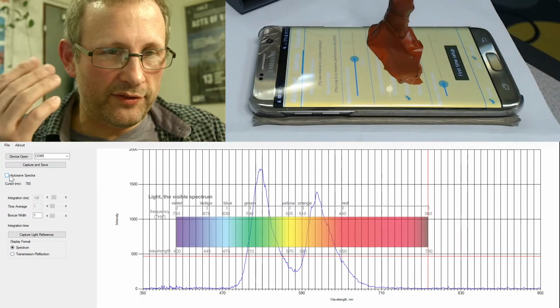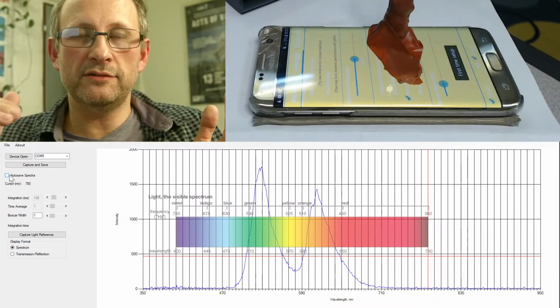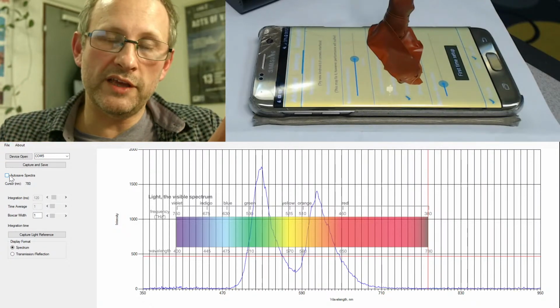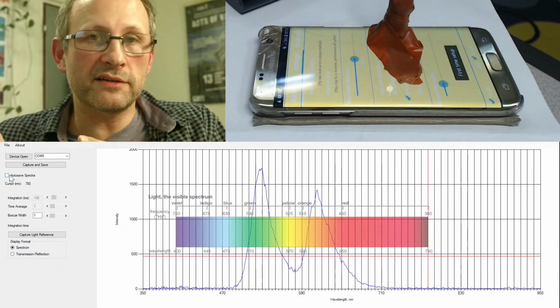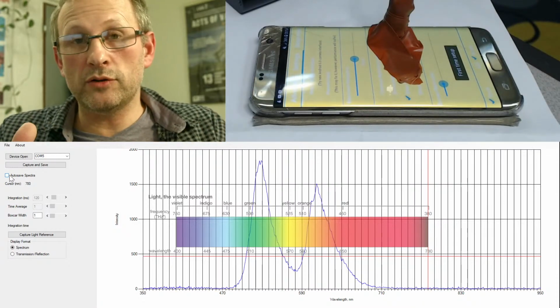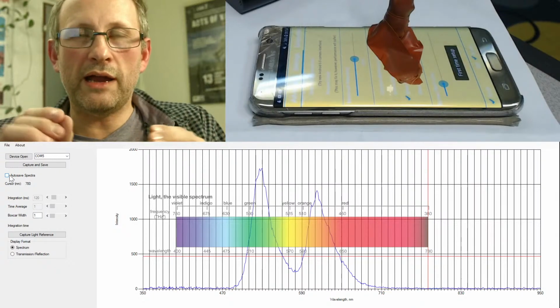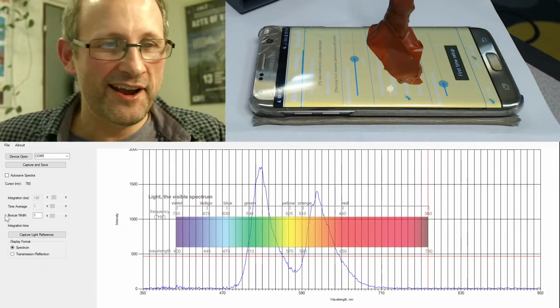But it actually has Python scripting, so I imagine that you could use Python and capture that into a database or whatever, and then you could show the progression through a timeline alongside a video of the experiment operating, and also maybe sync that with sounds that are going on, and sync it with voltage and current being used, and also with any potential radiation emissions being observed. So when you have multiple sets of data together, you can learn a lot more, let's put it like that.